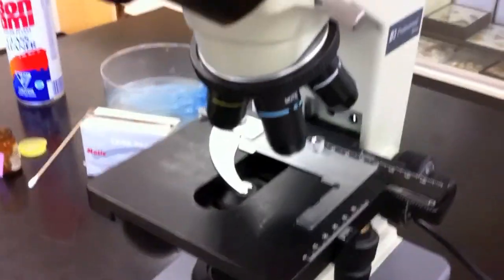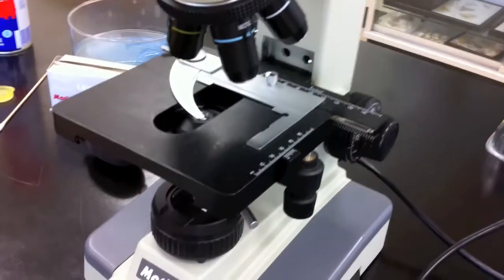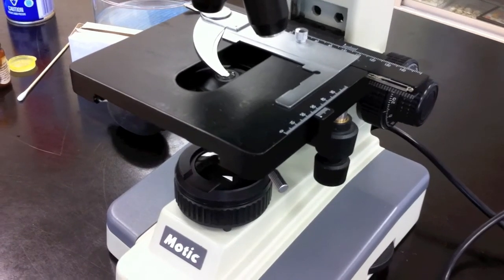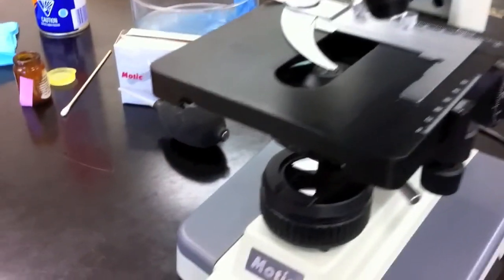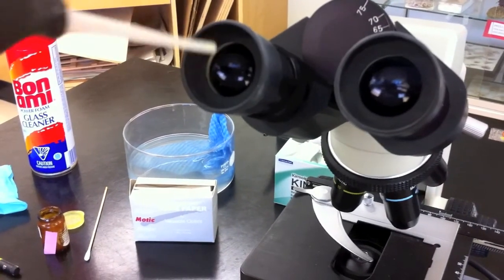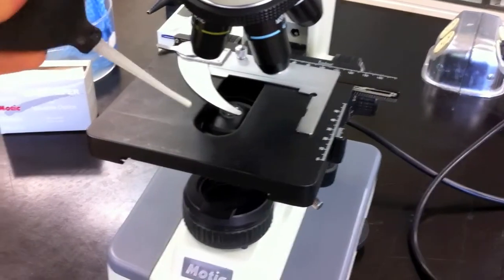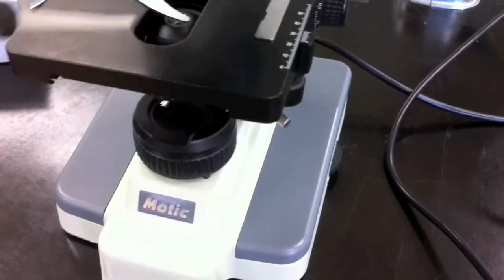Alright, as you can see this microscope has been in quite a bit of use and so it's quite dusty. We usually clean it every six months because it does get used a lot. The first thing we'll do is use this bulb to blow out the dust. This is just to get the dust off.